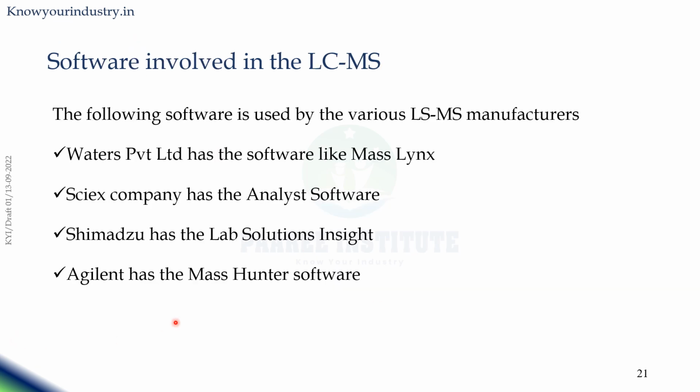Specific to liquid chromatography and mass spectrometer systems, there are different software packages based on the manufacturers. Waters is one of the manufacturers of LCMS systems, and uses MassLynx software. SCIEX is a company that manufactures LCMS systems, which we call API systems, which use Analyst software.